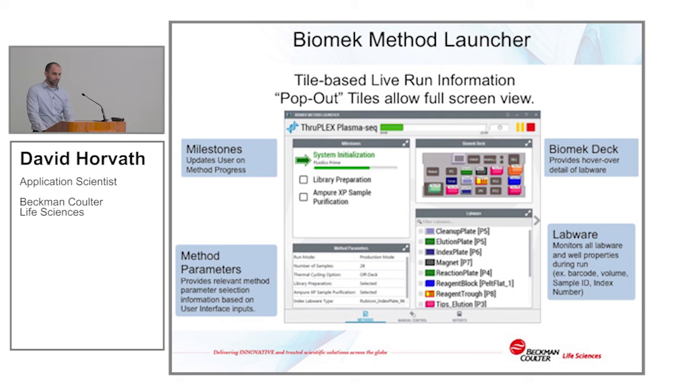Given that I just clicked on this because I want to show you how it works and it's just a slideshow, I really request that you come and check out the software in our booth, because slides just don't show the type of interaction that you're going to get with this method launcher application.